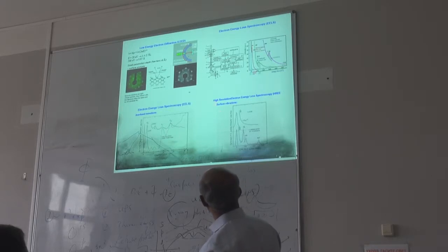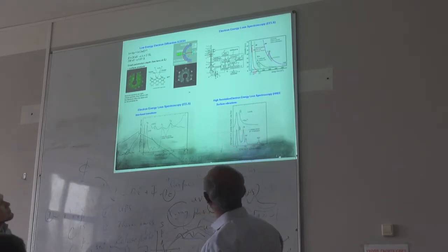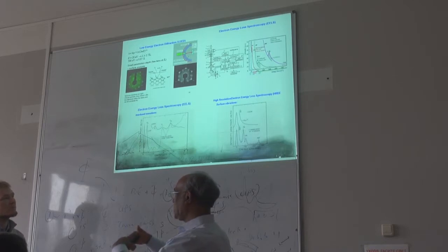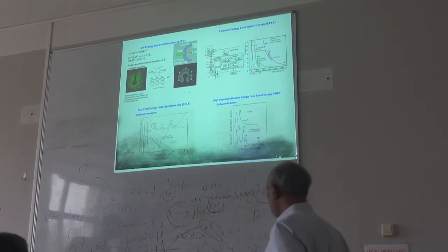Then some surface vibrations happen at low energies. This is low energy, you can see what is happening on the surface, not in the bulk. So bulk requires large energy loss, right? Surface requires only small energy loss. Okay, so I think I'll stop here.